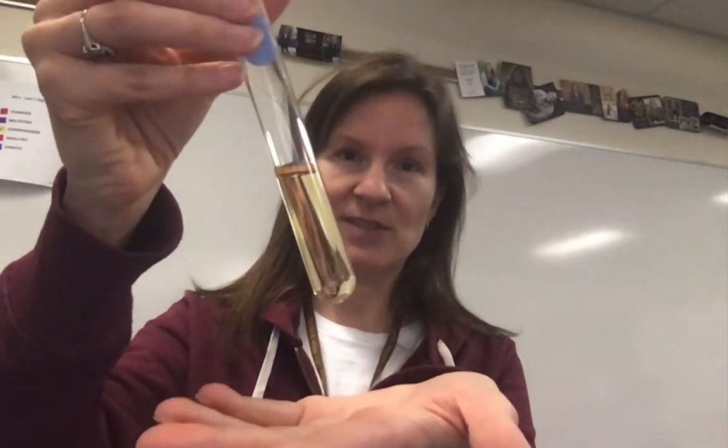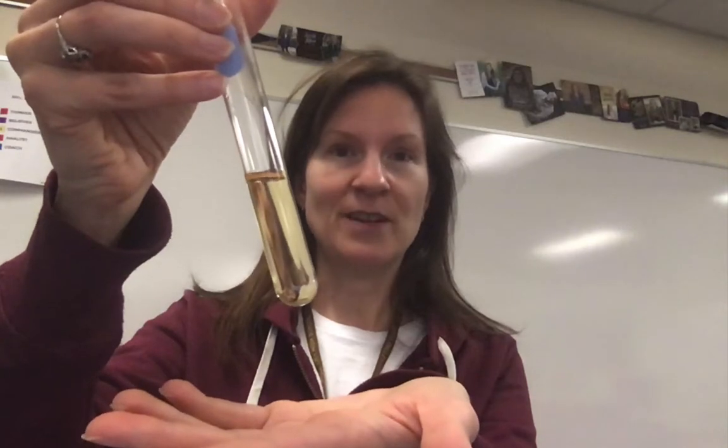Okay, because that's the first question in the lab. How do we know what the limiting and the excess reactant is? Just by observation. Okay, so make sure you're writing down observations of this test tube that will help you justify your claim of whether you think magnesium or hydrochloric acid is the limiting and what the excess is.